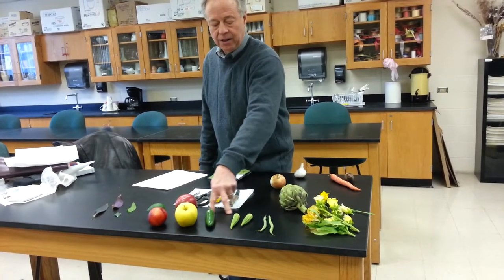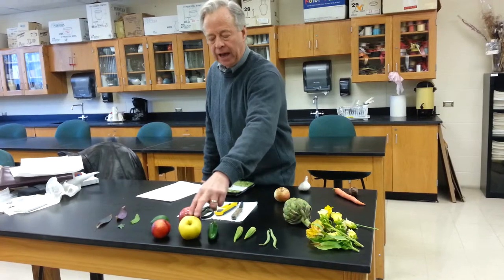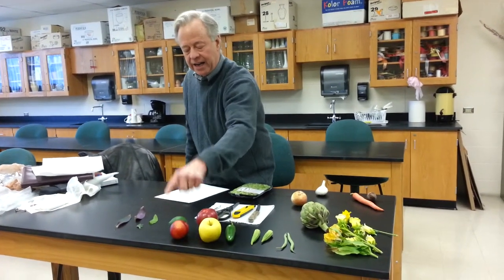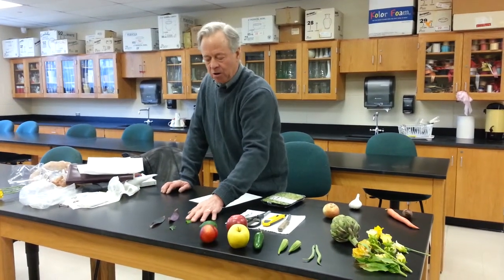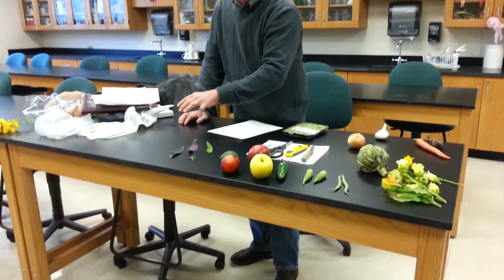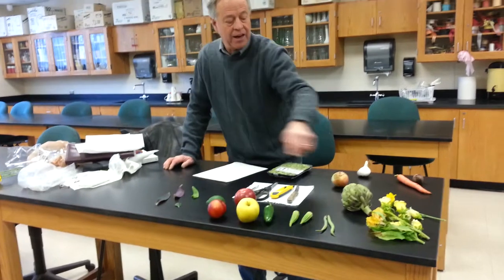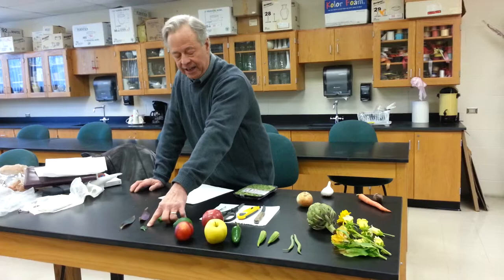We have fruit — which are beans, okra, pepper, apples, a nectarine, and a lime. We also have some leaves. Most of these are from monocots, members of the lily and orchid family. But here we have a leaf that I pulled off of this daisy flower, and that is a dicot leaf.